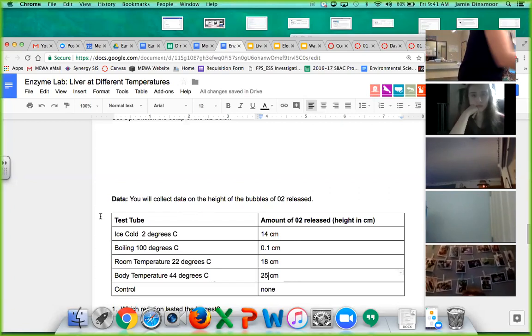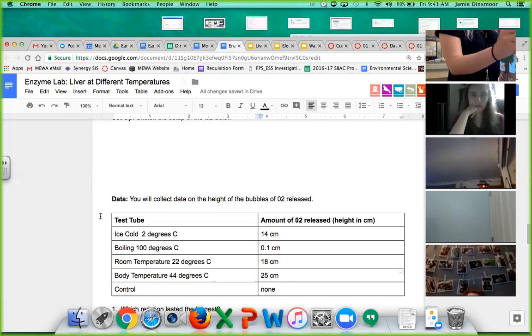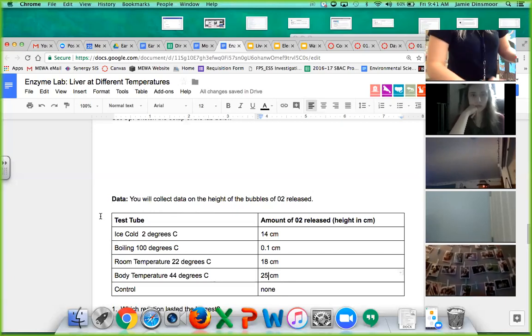So I have this, I don't know if I feel safe putting fire near plastic. Okay. Use this guy here.